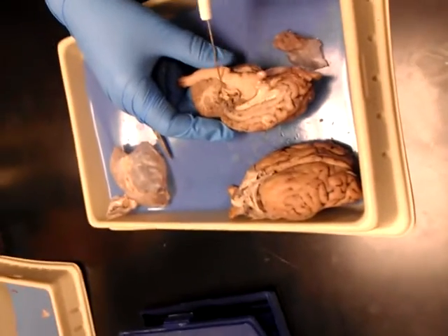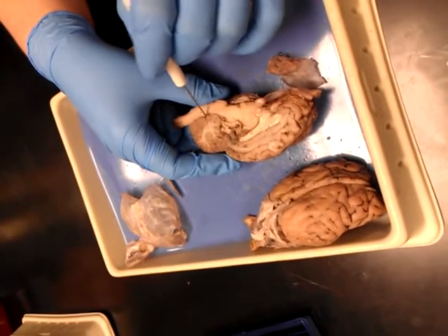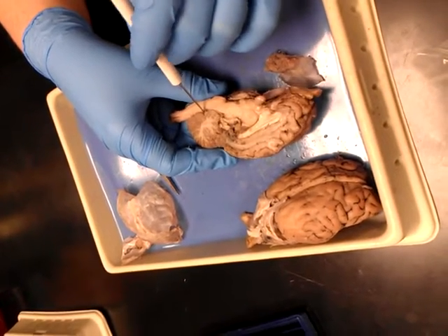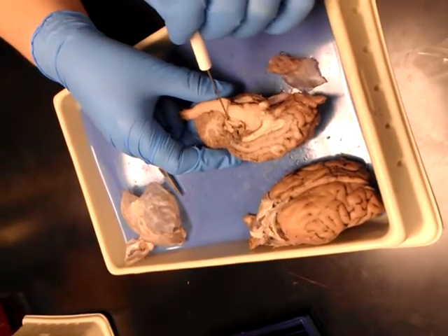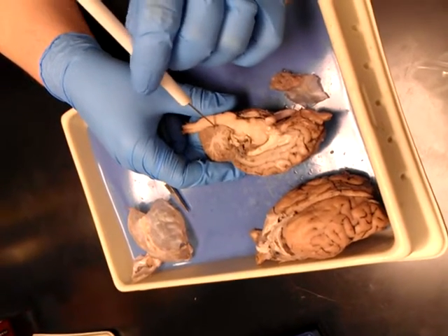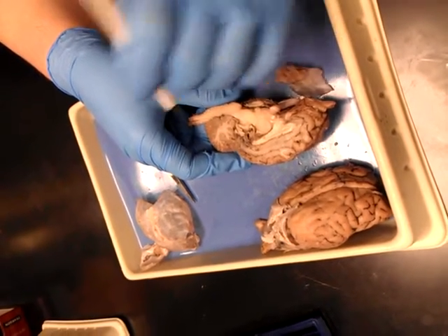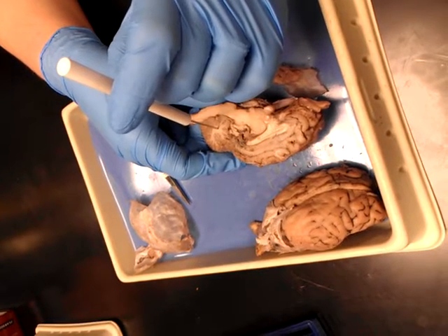Then you come down — the cerebral aqueduct comes down to your fourth ventricle, which I think of as like watering the tree, because this is where cerebrospinal fluid is going. Right here at the base of the tree, this is your fourth ventricle. They put it in the tree, they want arborvitae.